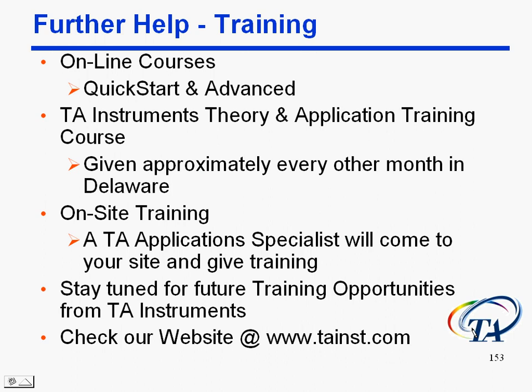When we do the hands-on, we do it on your instrument and we run your samples. So that's probably the best way for you to learn. Now there is a charge for this. It's $1,500 a day plus expenses. But that'll get one of us from applications into your lab, and we will sit there and spend the time with you running your instruments. I've gone in and spent a day per technique with people, or I've spent 2 days on one technique. Once again, we can configure it per your needs. And on the expenses, don't worry, we don't fly first class or anything. It's just regular coach class to get there.